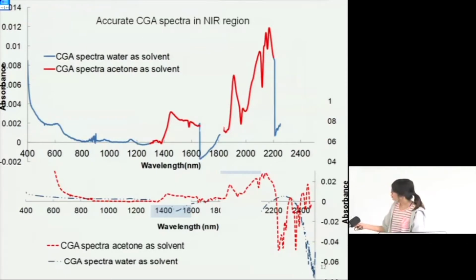And because after 2100 nanometers, both acetone and water have strong absorption, after this wavelength, I removed the data.